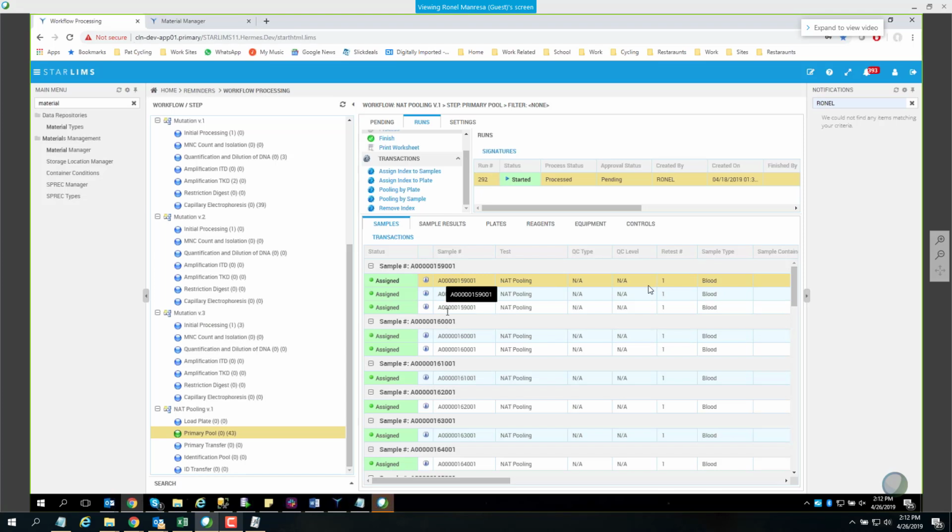By the way, Renel, I am recording this with my Camtasia, so that I'm going to share this with Nilka later on, because she's going to have to reuse something like this. She knows this is not in XFD, but the logic behind it, because in her case she has a 384 well plate that I think she has to do the same exercise like 4 times if she wants to assign the indexes to the plate.